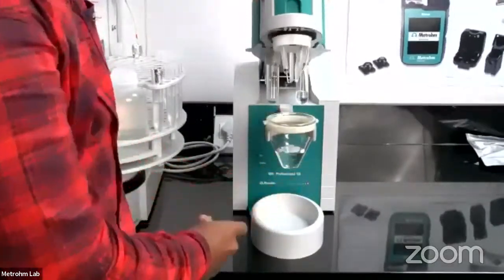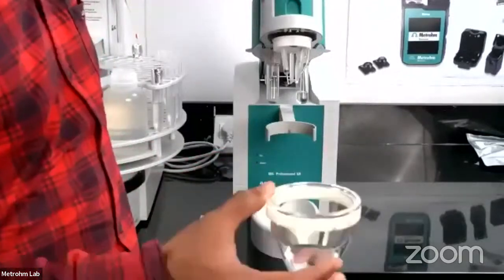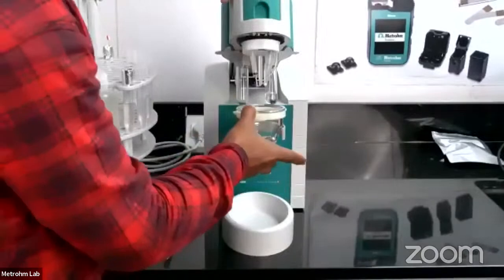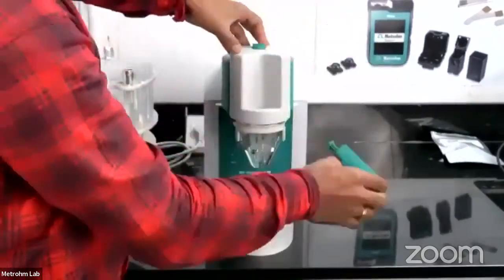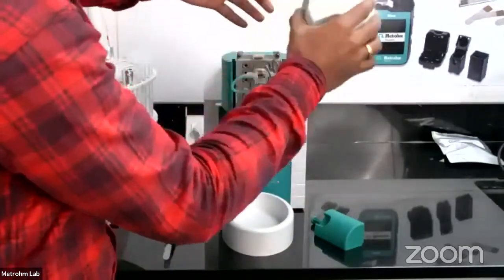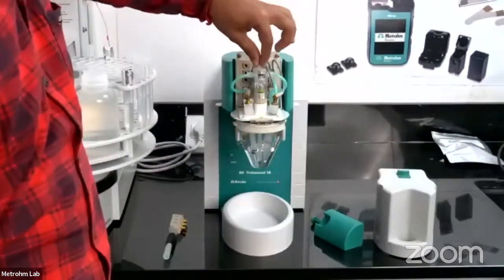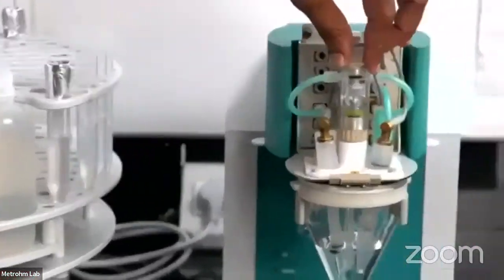And here we have the voltammetric vessel, and you can see we can take the samples in the vessels like this and perform the analysis. As Niranjan sir has already explained, we basically have a three electrode system in voltammetry instruments. I'll show in detail. So here you can see, this is a basic multimode electrode, also called MME.